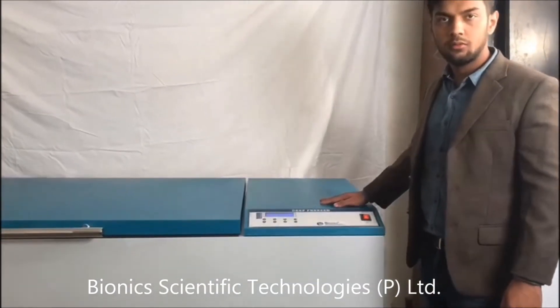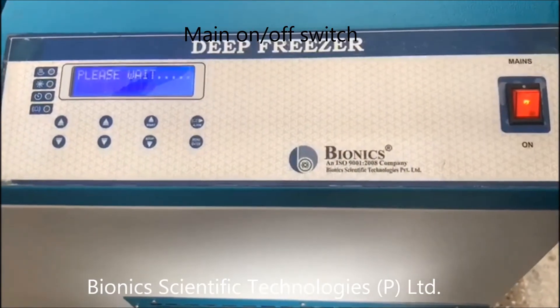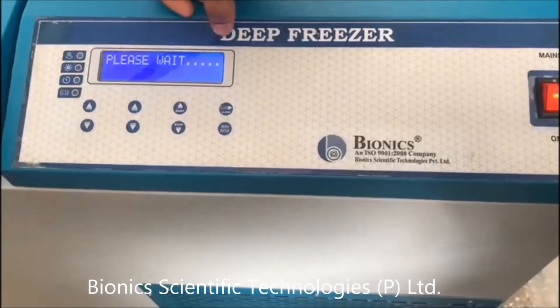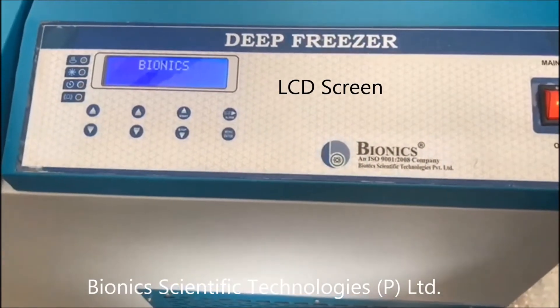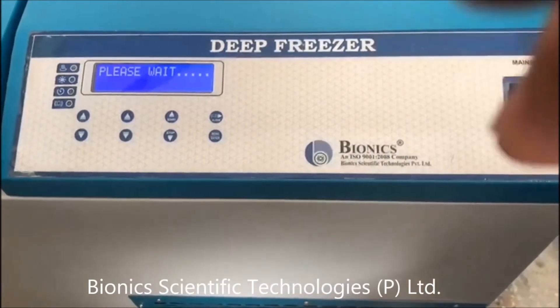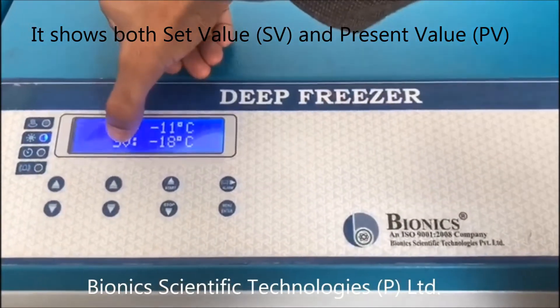Now I will show you how to start and operate this machine. This is the mains button. First you will switch it on like this. As you can see it is showing 'Please Wait', so you need to wait for a few minutes. This is the control panel, which is showing PV and SV.